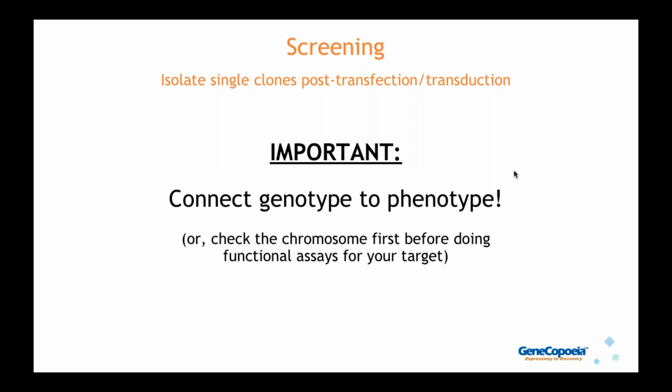Okay, and the next thing to keep in mind when screening is to connect the genotype to the phenotype. What I mean by that is we highly recommend that you screen the chromosome to make sure it has the genetic modification before you do your phenotypic screening.